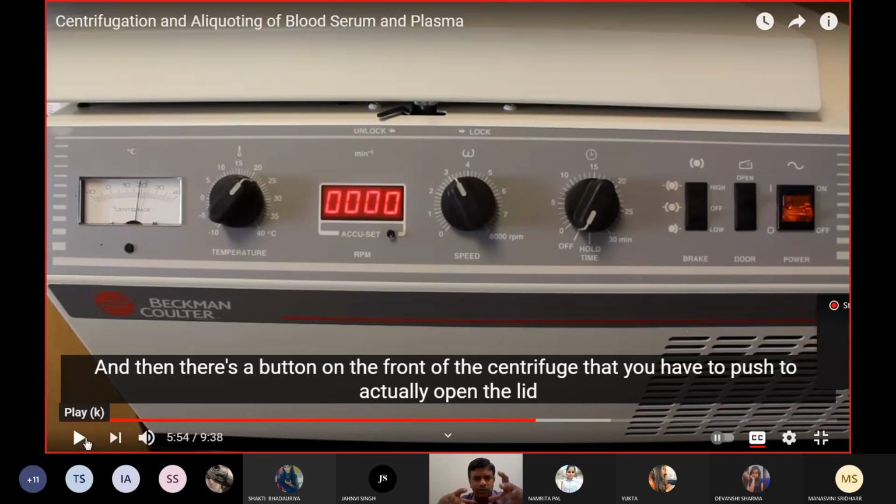You get very small centrifuges in the lab. Whenever you visit the lab, I can show you those very small centrifuges. You can see a centrifuge which only has speed, no other thing, no temperature, no time.